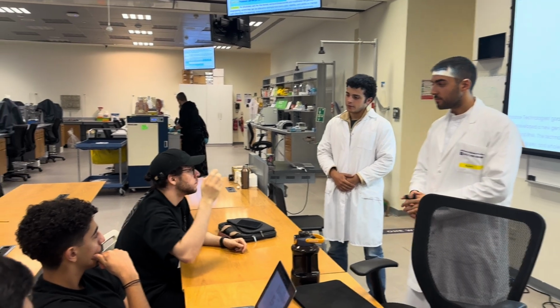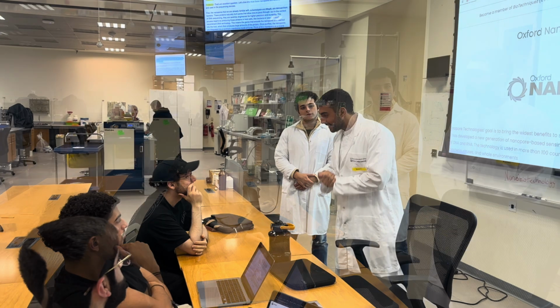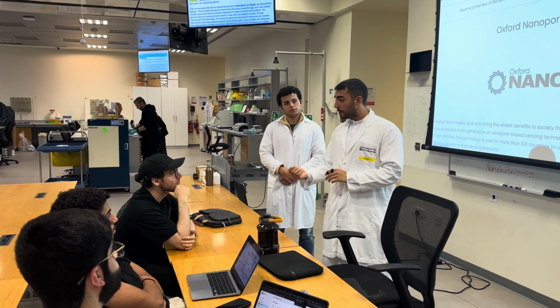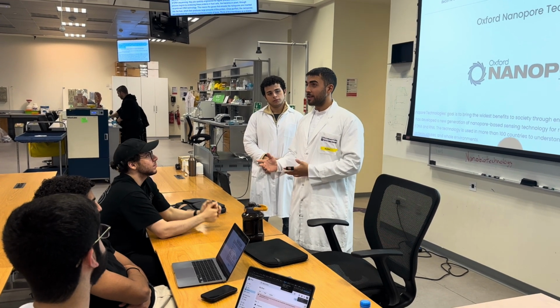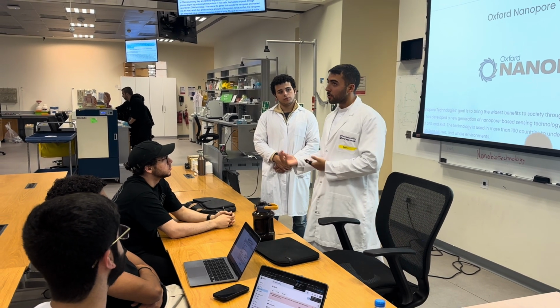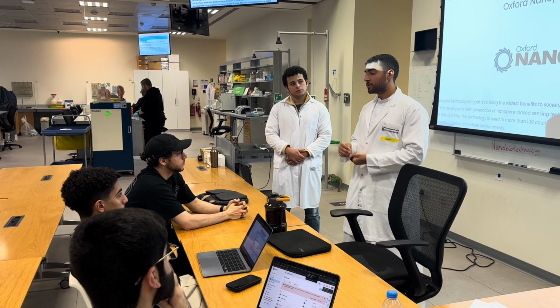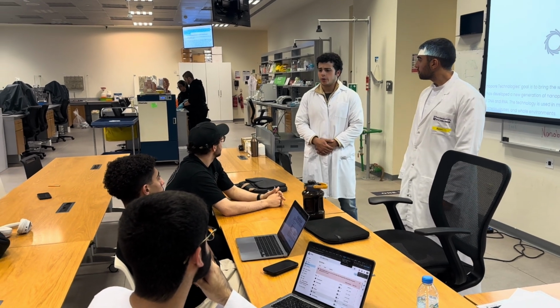Yeah, Mister, can we genetically engineer these pores? Absolutely can. So as I mentioned, some of these pores are modifiable using genetic engineering, where they can be altered to optimize their pore size, stability, and ability to interact with DNA and RNA. For example, motor proteins or adapters can be added to slow the DNA movement, which enhances signal clarity. Anyone has any more questions?